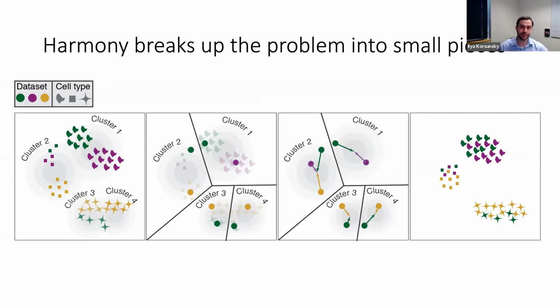Depends on how donor is related to dataset. If donor is dataset, then yes. If donor is nested within dataset, then maybe you need to do both, or maybe you choose not to.